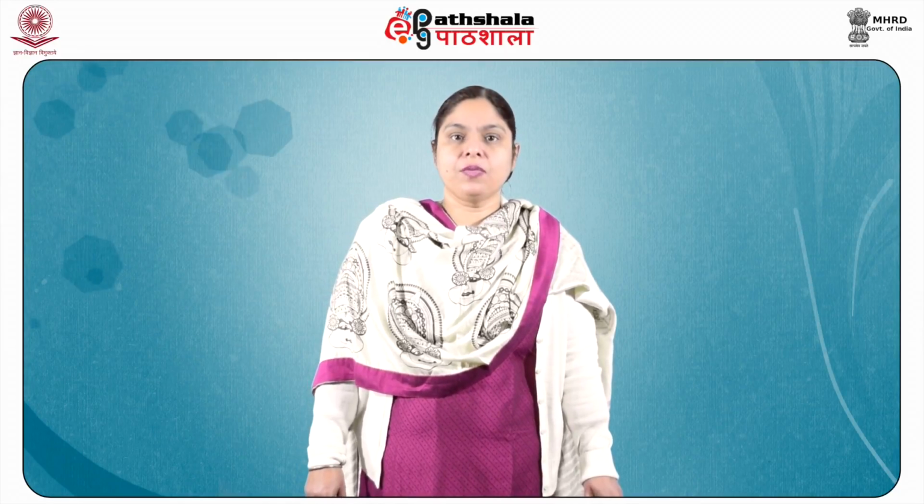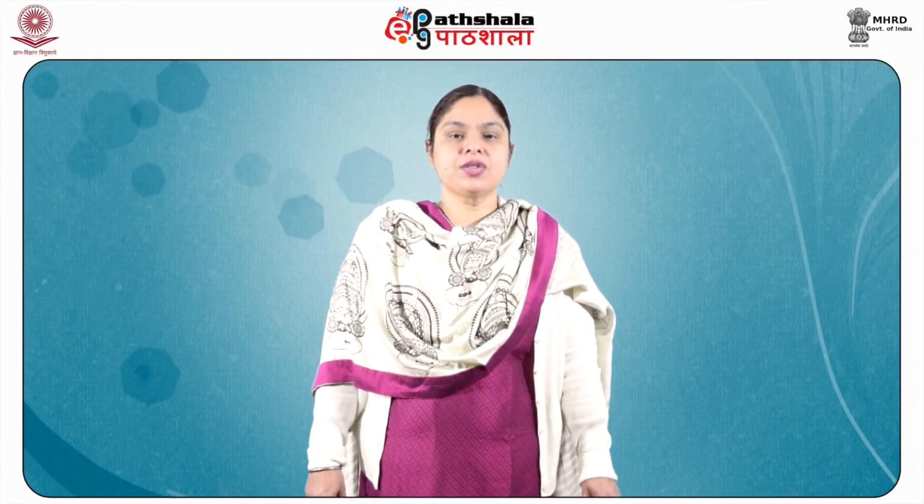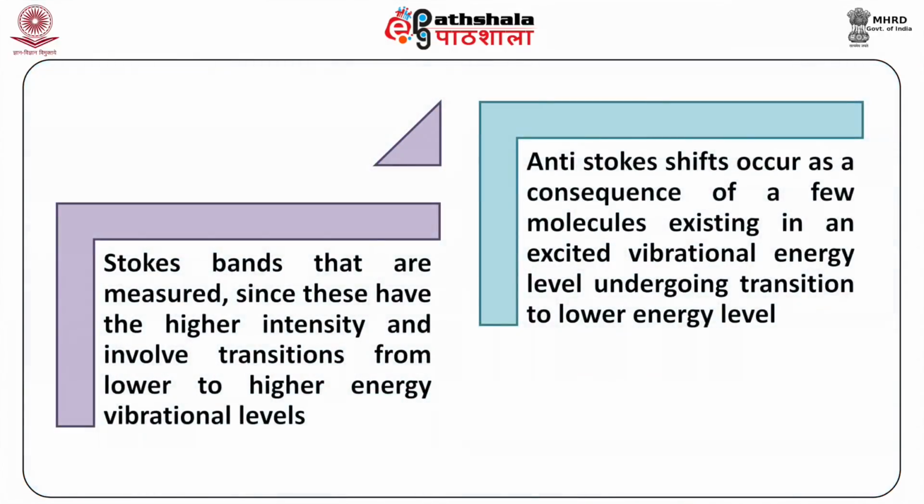Now let us do a brief sketch of what these spectroscopies are. In Raman spectroscopy, monochromatic radiation of a given wavelength strikes the sample and gets scattered in all directions. Most of the scattered radiation is elastic, but some of it is changed in wavelength, either increased or decreased, called the Raman shift, by an amount that corresponds to the sample's Raman active vibrational mode wavelength. The Raman shift can be positive as well as negative, and the anti-Stokes lines are also shown. In this spectroscopy, it is the Stokes bands that are measured, since these have the higher intensity and involve transitions from lower to higher vibrational energy levels.